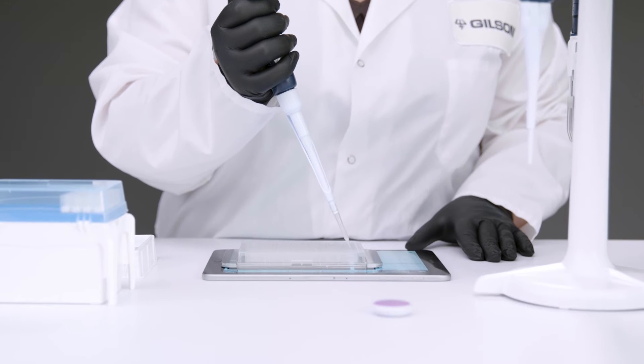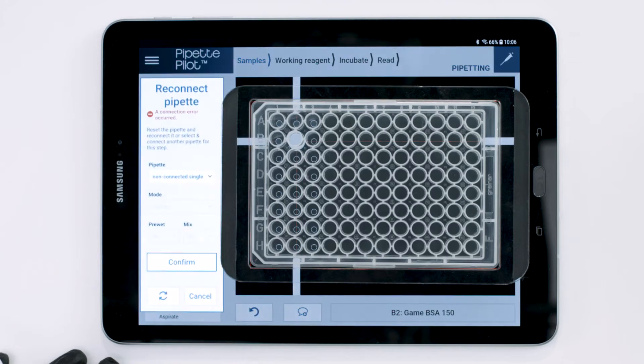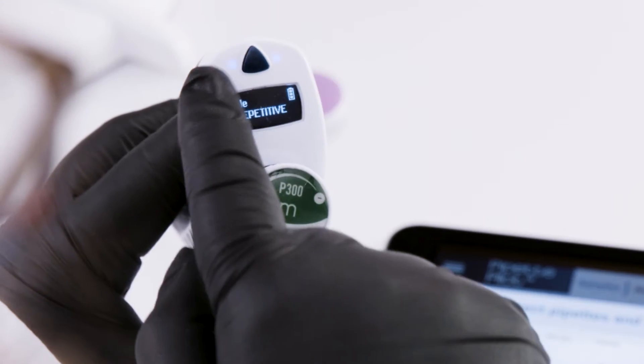If a pipette loses Bluetooth connectivity during a run, Pipette Pilot will display a notification that the connection has been lost. Check to make sure the pipette you want to use has its Bluetooth enabled.